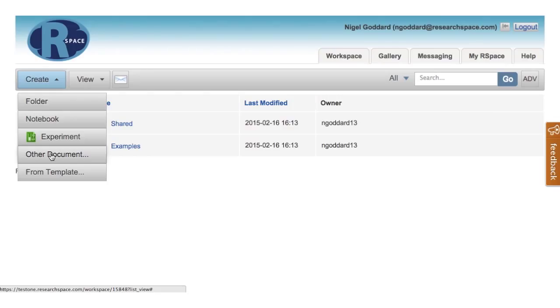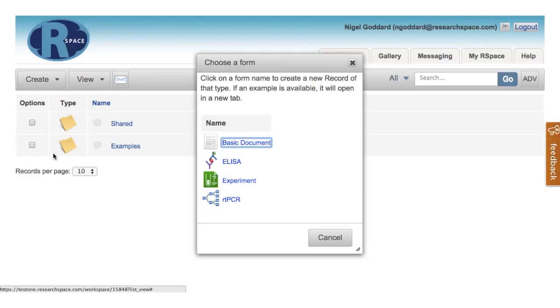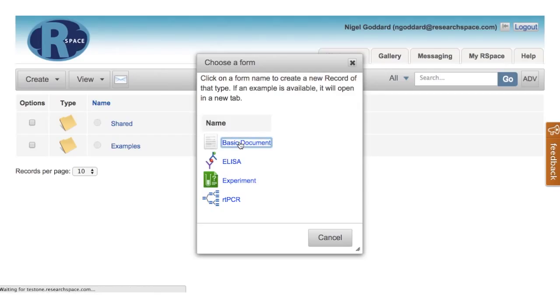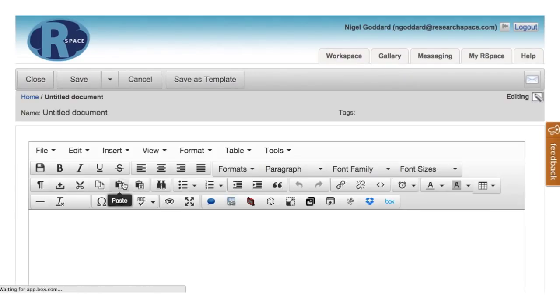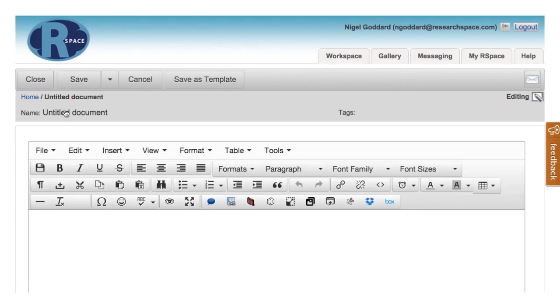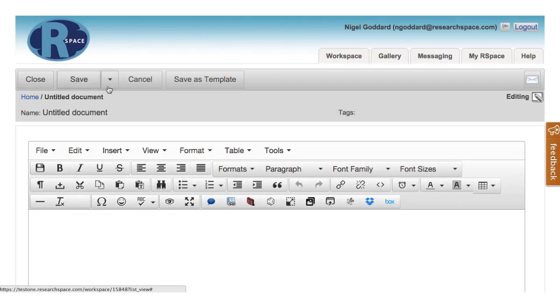So let's suppose we want to see what else is available. We can click here, and we can create, for example, a basic document which has a single text field. And that's that document created.